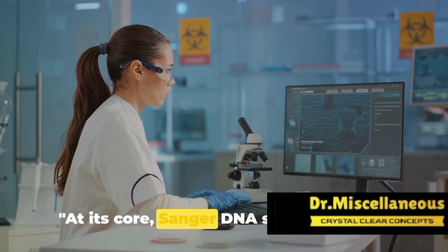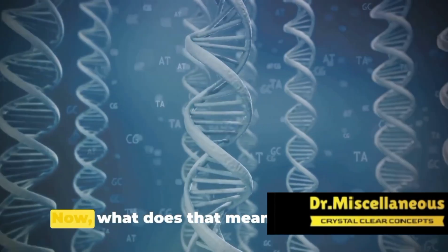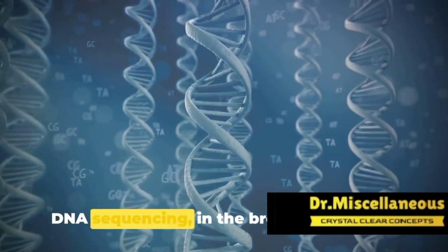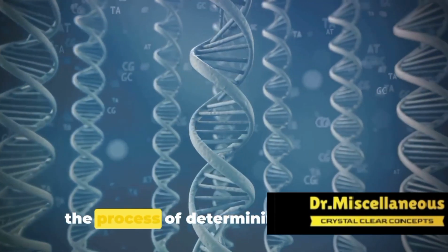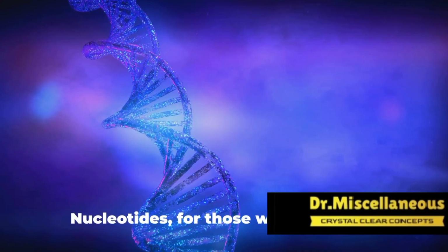At its core, Sanger DNA sequencing is a method to read the genetic code. Now, what does that mean exactly? Well, let's break it down. DNA sequencing, in the broadest sense, is the process of determining the precise order of nucleotides within a DNA molecule.